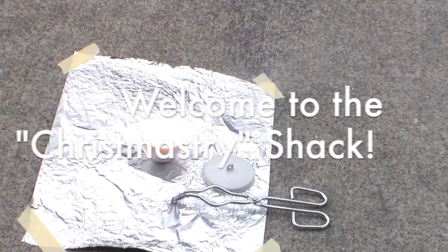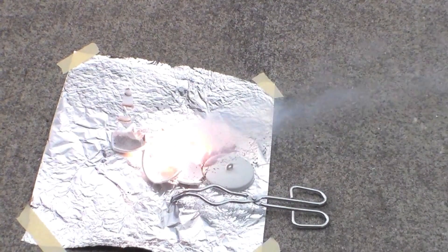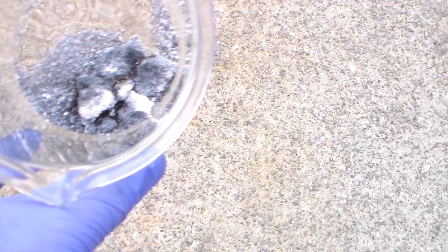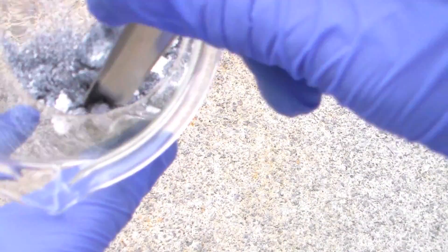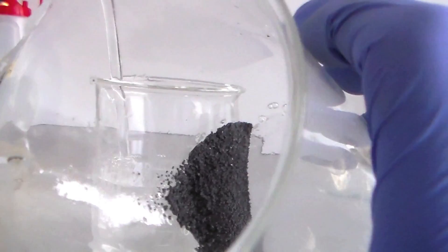I have a special Christmas-themed video for you guys, because I thought, what says Merry Christmas better than a powdered black semi-conducting metalloid, or in other words, elemental silicon?